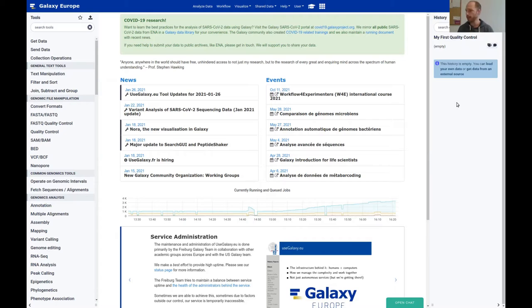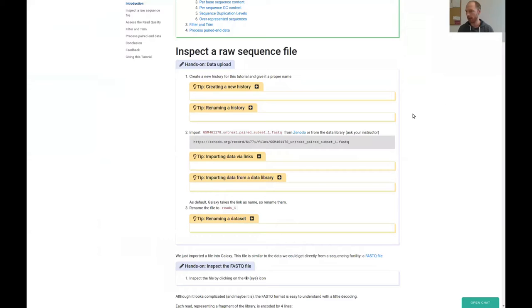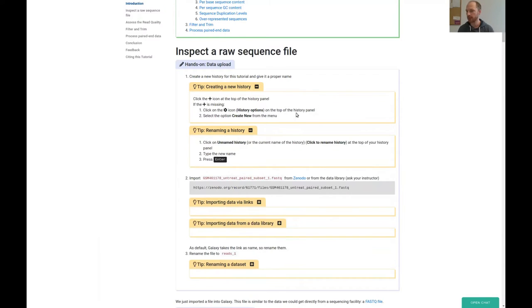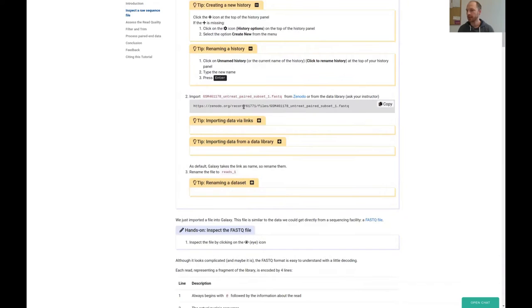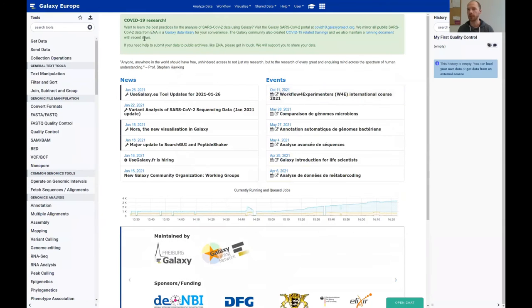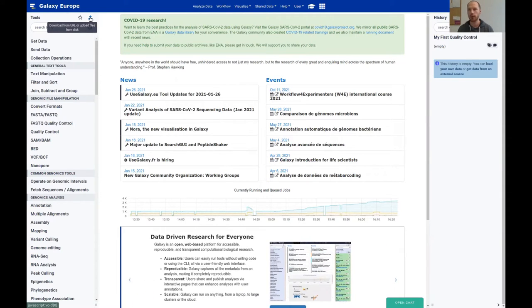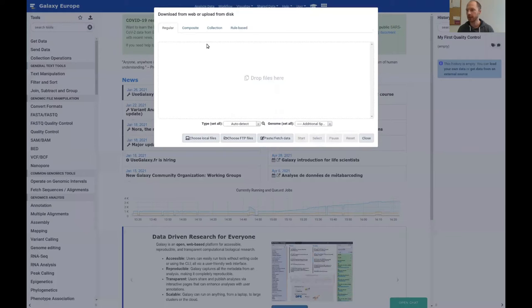Let's name it 'my first quality control.' Then we switch back to the hands-on material. We did this — created a new history, renamed it. Here is the link for our example data, so we just click here on copy.